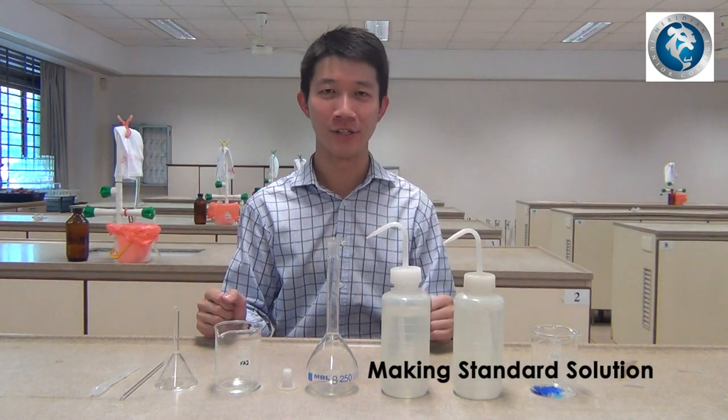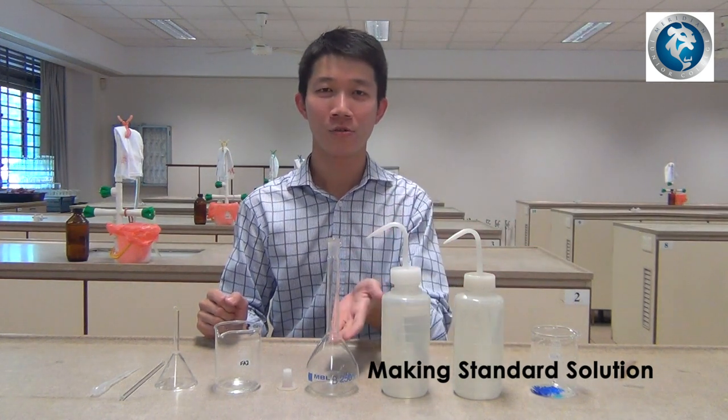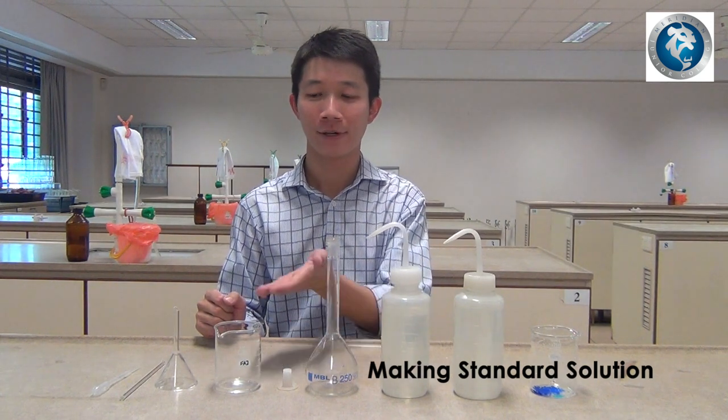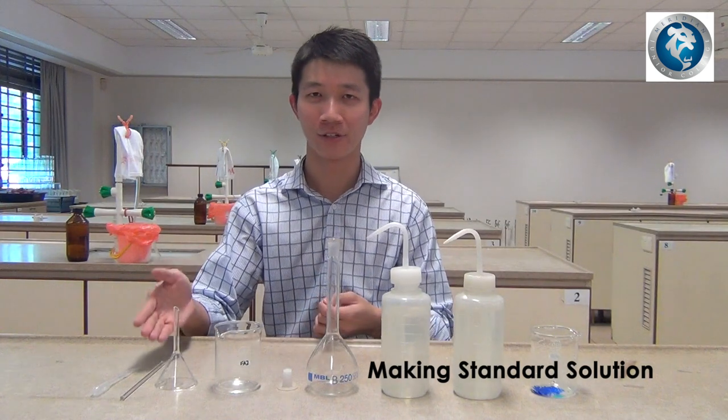What are the apparatus that you need? You need the solid, de-ionized water, a 250 cubic centimeter volumetric flask, the cap, a glass beaker, glass funnel, glass rod, and a dropper.